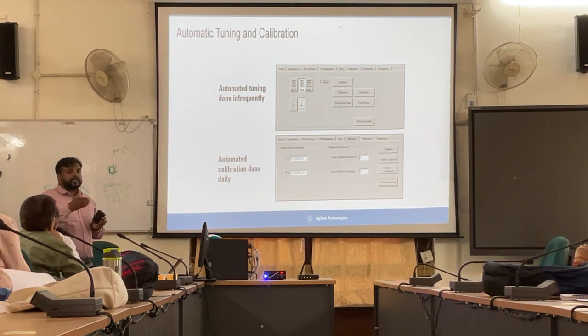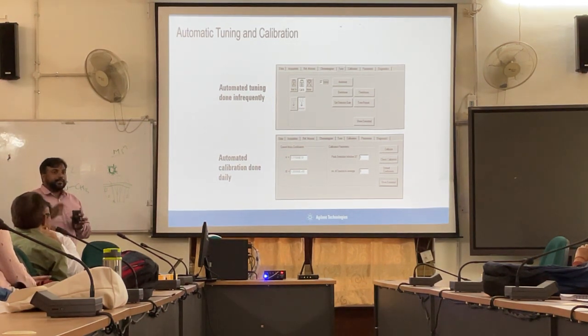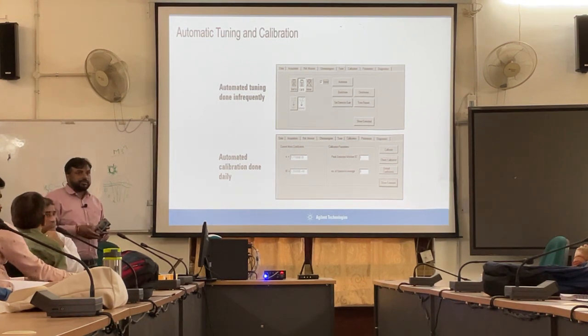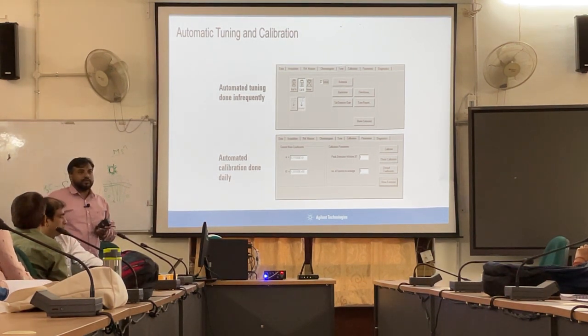We can do the quadrupole calibration and TOF calibration both. Still, if there is any malfunction or breakdown, then we have to tune the instrument. It takes time also, because from the source until the detection, all the voltage parameters are optimized at the same time.